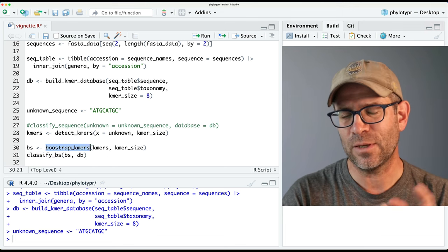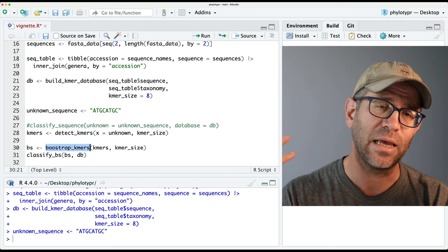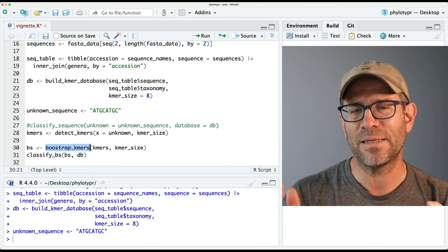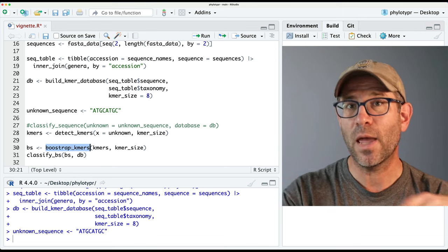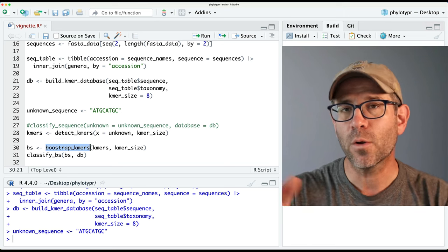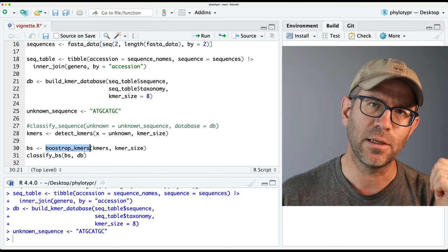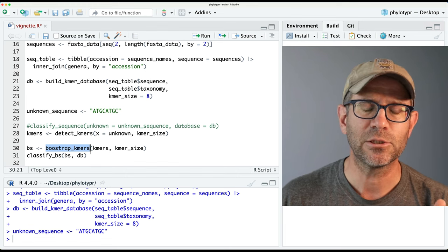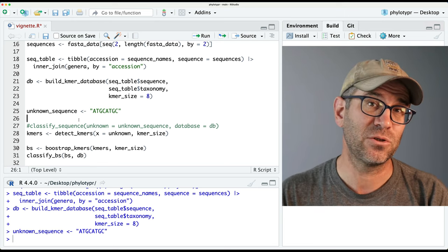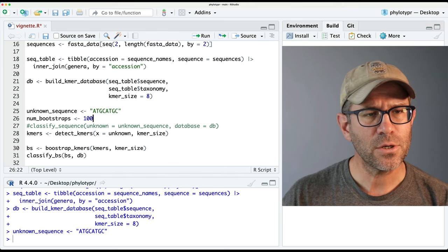What happens with the bootstraps is that it'll do one divided by the number or the size of the k-mer. So if we have 8-mers and a 400-nucleotide sequence with 400 bootstraps of k-mers, basically what we're going to be taking is 50 k-mers out of that, randomly sampled with replacement. We'll take those 50 and then classify them. Because that is sensitive to the random number generator, we want to repeat that a large number of times. Generally we do this 100 times in the original RDP implementation, as well as the mothur implementation — the hope is maybe we can get to a thousand.